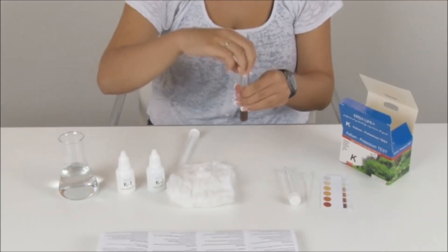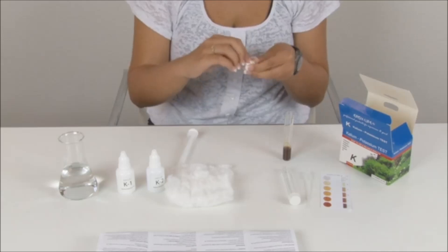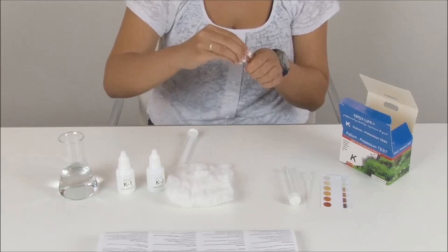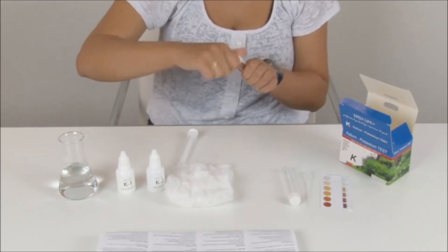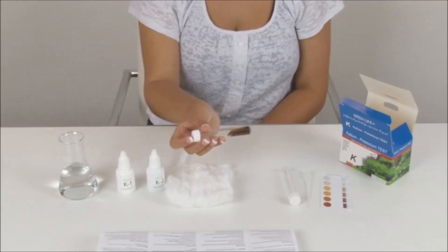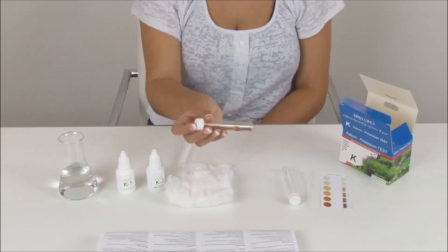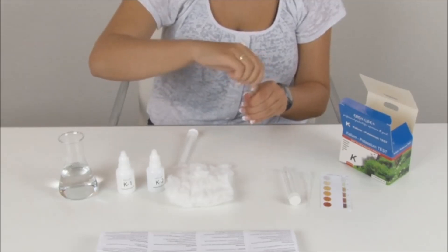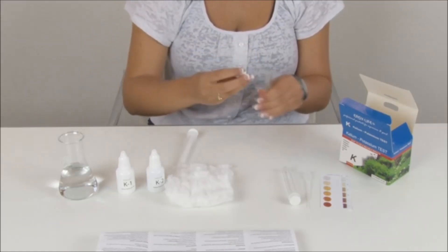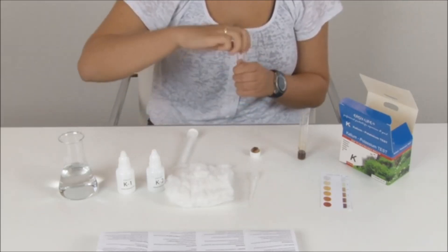Uncap the test tube and press firmly cotton wool into the cap, then screw the cap back on. Tilt the test tube and allow the sample liquid to be sucked up by the cotton wool. Then uncap the test tube.